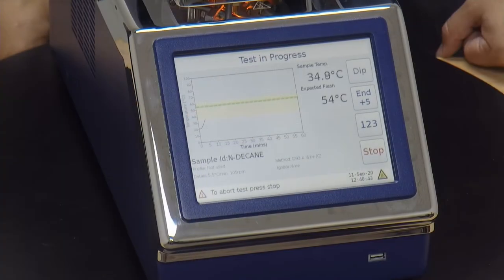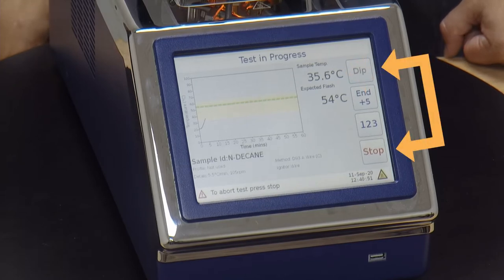I'd like to point out a couple different things you can see here on the screen. We have our expected flashpoint listed. Above it we have our sample temperature. On the side we have a dip button, a plus five degrees button, and a stop button along with a number button.